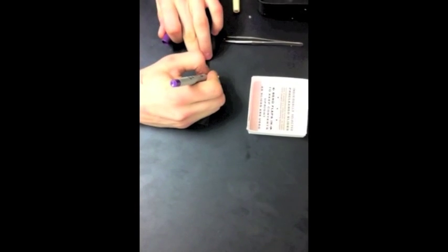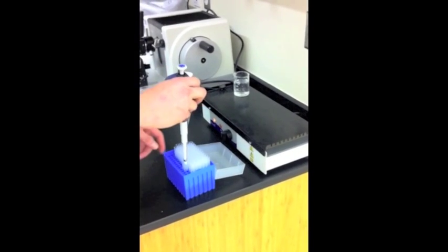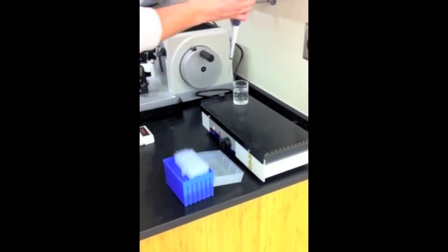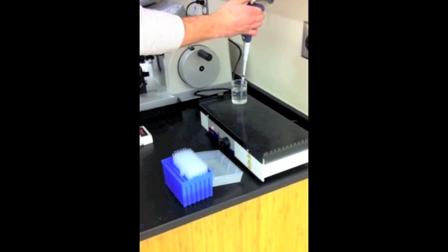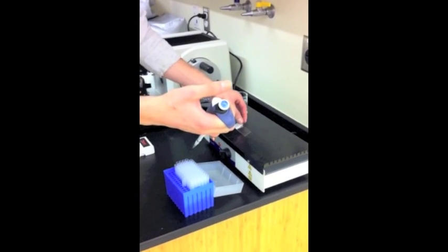Label a slide with your organ, your initials, and the date. Be sure to use pencil on the frosted portion of the slide. Put a few drops of warm water on the slide using a transfer pipette and place it on the slide warmer.